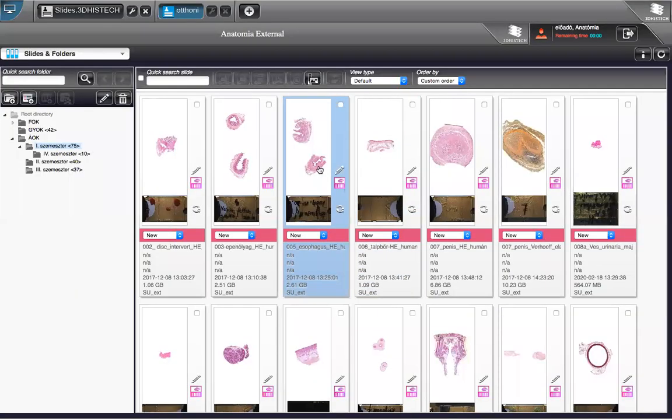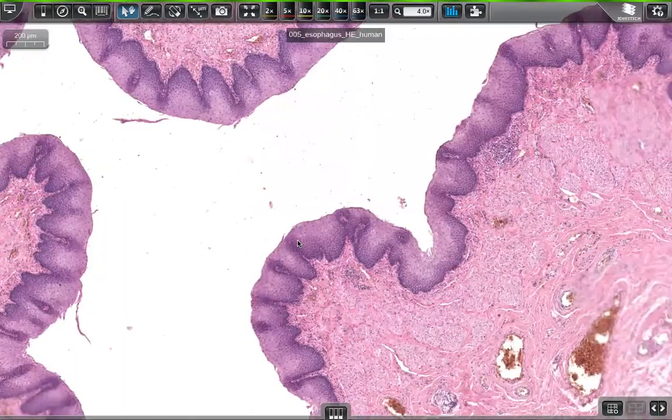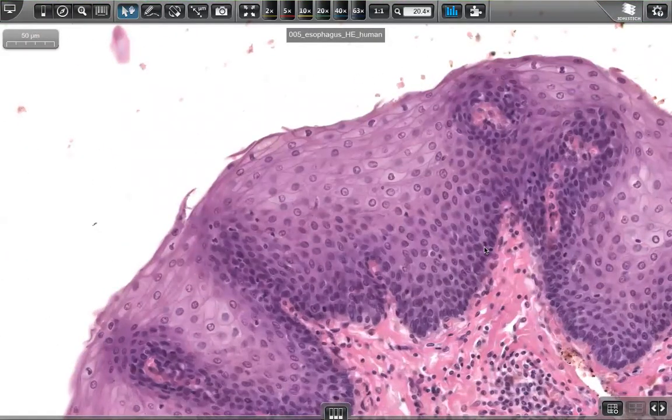In the esophagus, there is another type of epithelium. So stratum basale here, stratum spinosum or polygonale, and at the top the compressed layers. These are part of the stratum planocellulare. So that's the stratified non-keratinized squamous epithelium, which we can see in the esophagus, oral cavity, surface of the tongue, vagina, so this area.